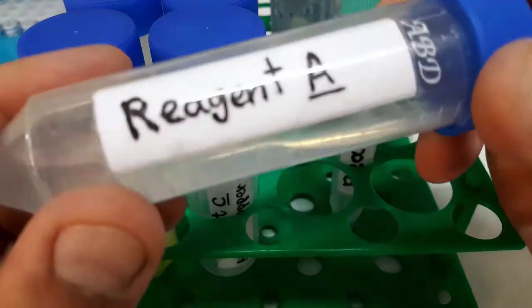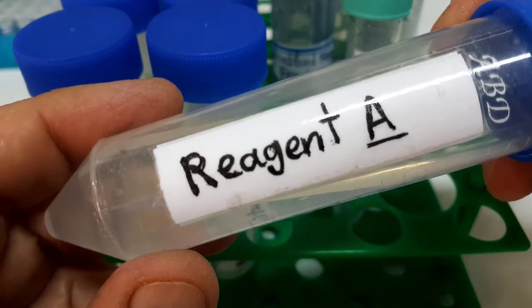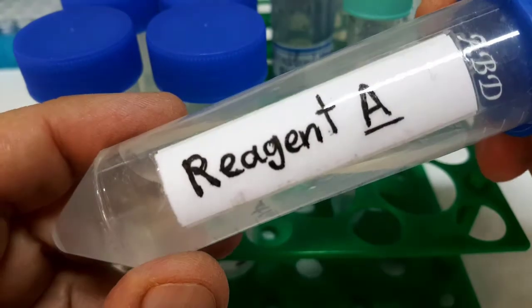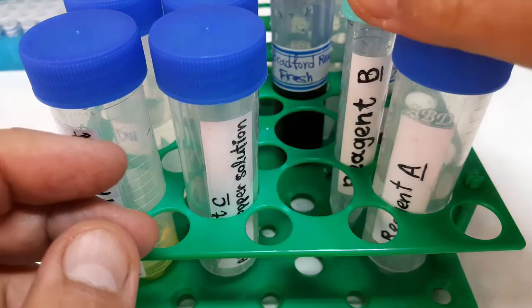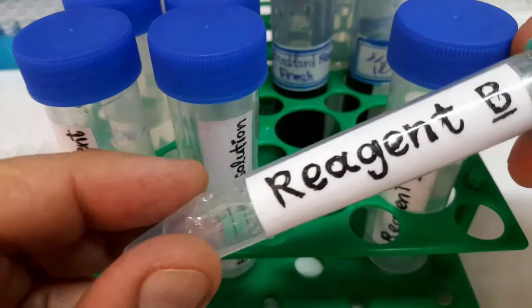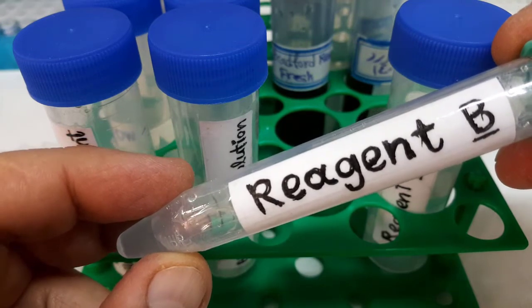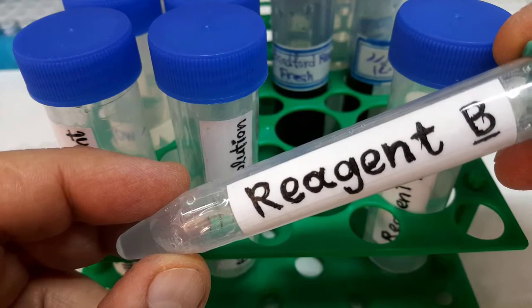For measurement of protein concentration of samples by Lowry method, we need reagent A, which is 2% sodium carbonate in 0.10 normal sodium hydroxide. Reagent B is 0.5% copper sulfate pentahydrate in 1% potassium sodium tartrate.